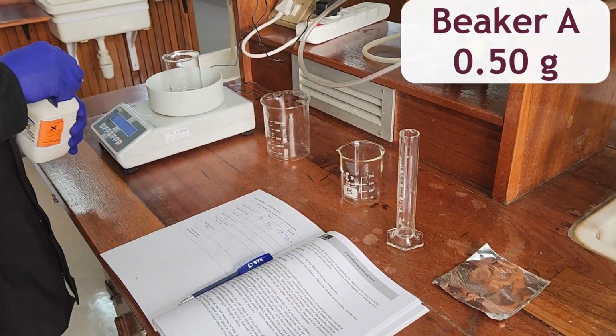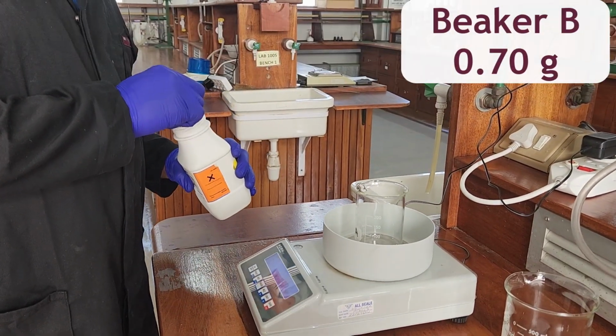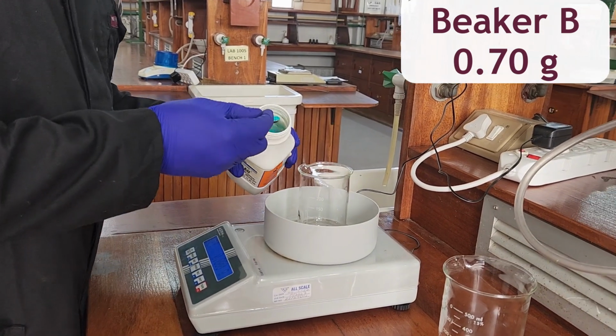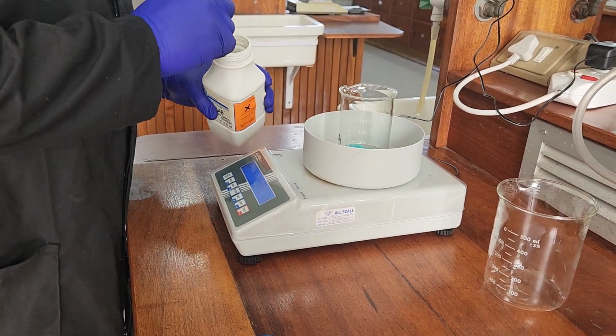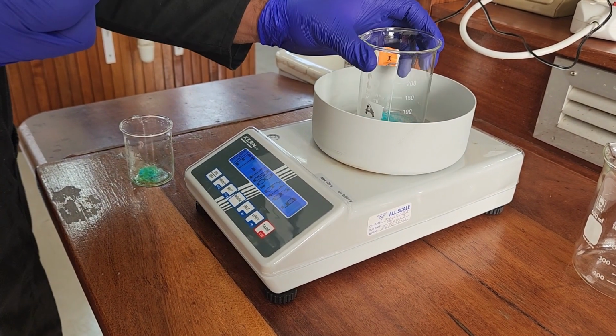Weigh approximately 0.50 grams of the hydrated copper chloride directly into beaker A and approximately 0.70 grams of the hydrated copper chloride directly into beaker B. Record the exact mass of the hydrated copper chloride in each beaker in the data report table.